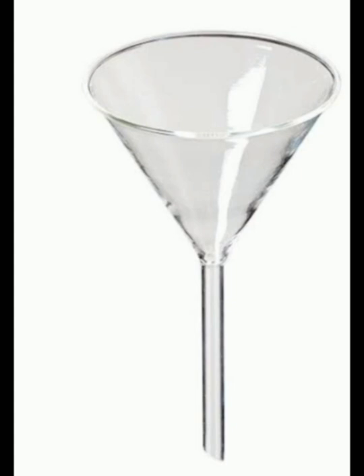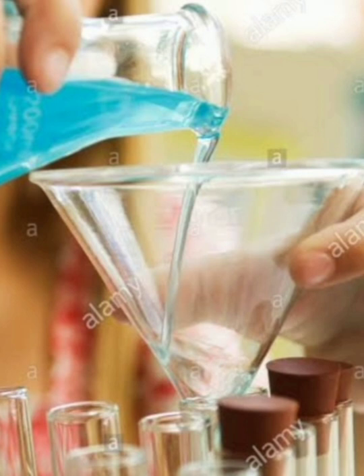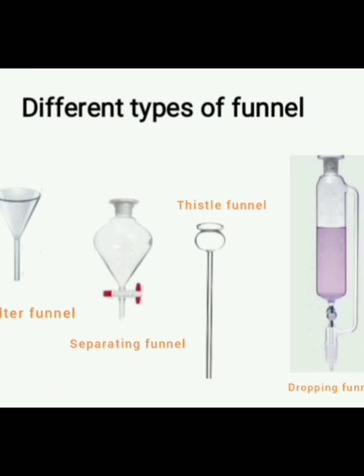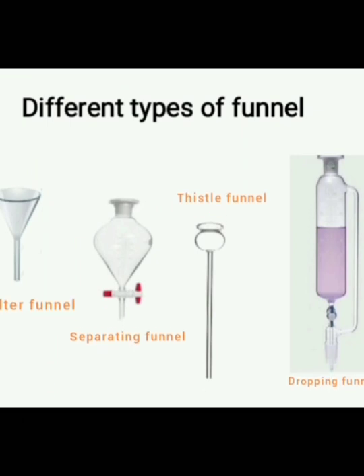Funnel. Laboratory funnels are used to channel liquids or fine-grained chemicals into labware with a narrow neck or opening. They are made of plastic or glass. There are different kinds of funnels that have been adapted for specialized applications in the laboratory.